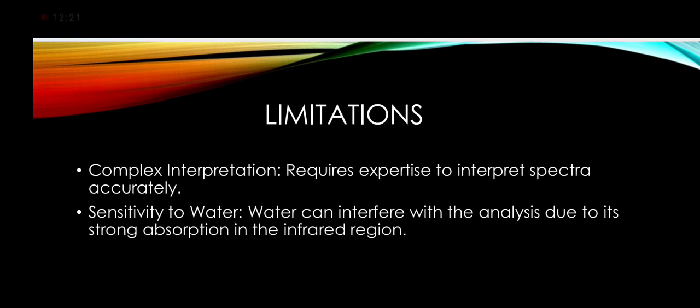There are some limitations. Complex interpretation. It requires expertise to interpret spectra correctly. Sensitivity to water. Water can interfere with the analysis due to its strong absorption in the infrared region.